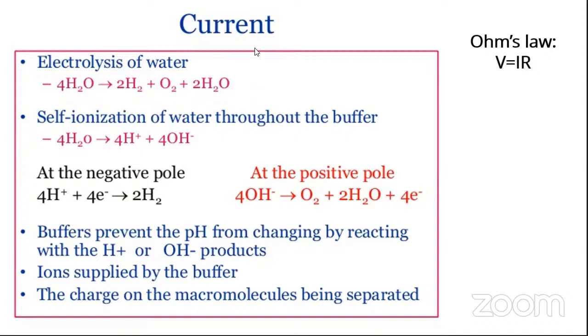Or what will be the resistance determining factor, if I want to put it like this? Yes, anyone? This is basically resistance to the flow of current.